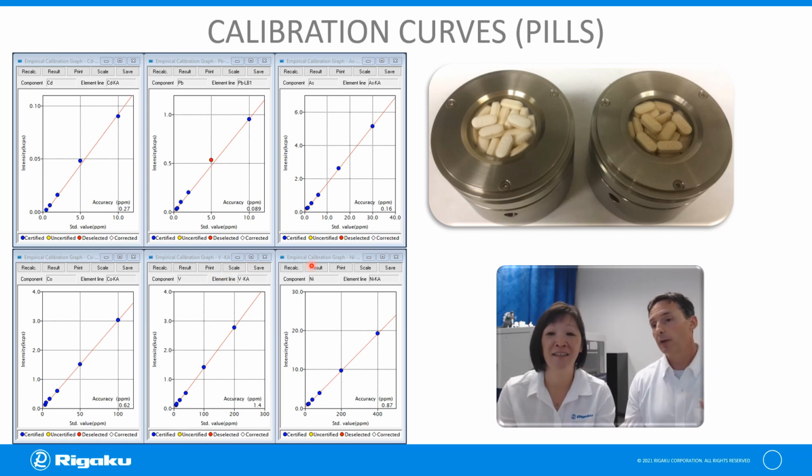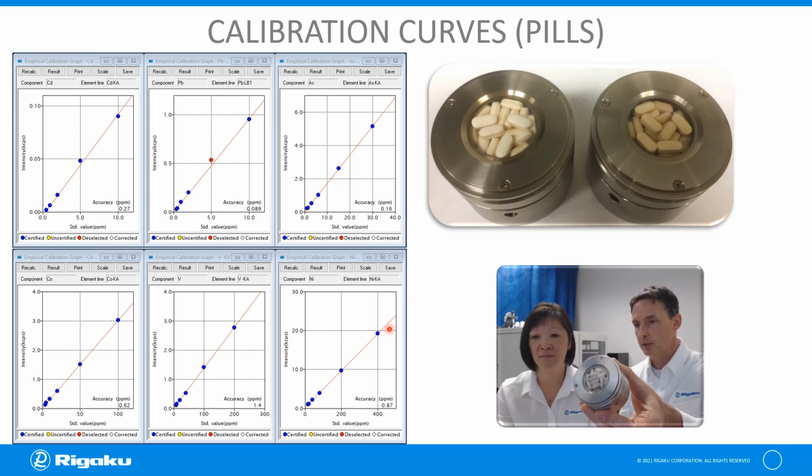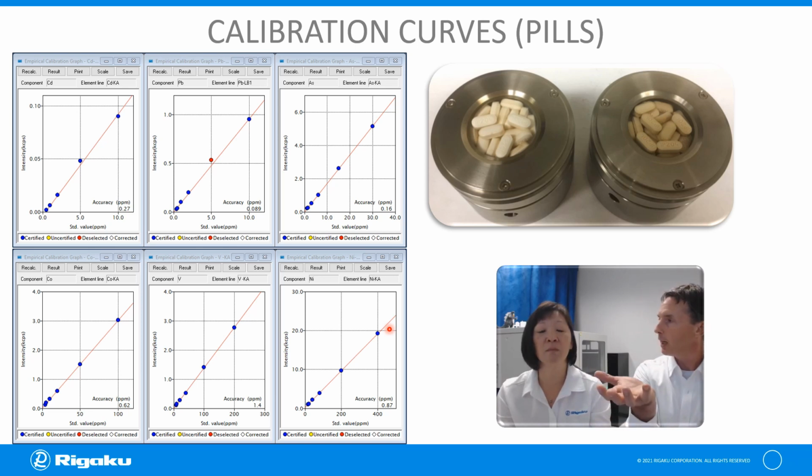Yeah, we expected we were going to have to run it again, shake it, and then average those results, but we didn't. The first was just randomly how we put them in, and this is a picture of the pills in one of our tube above cups. We have the tube below model that Thanh was showing on that first slide, the Primus 4 versus Primus 4i.